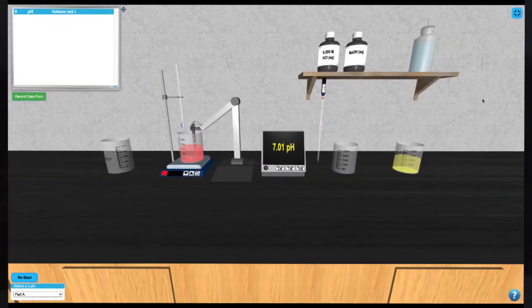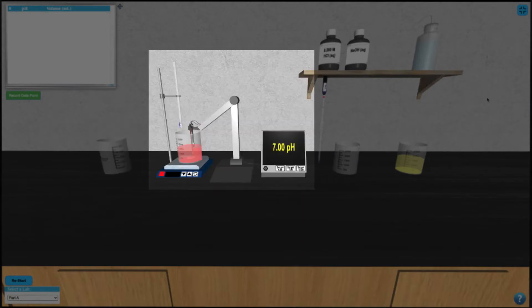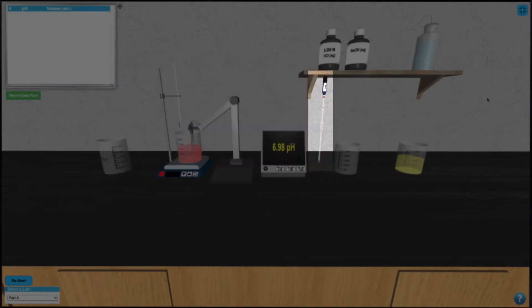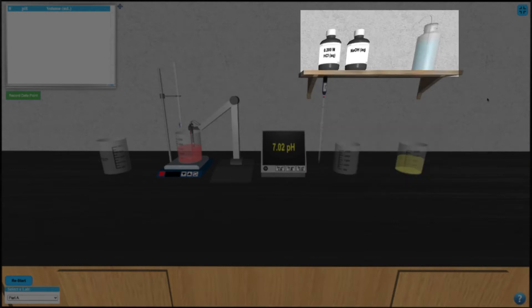In this simulation, we have a waste beaker, a burette with stir plate and pH meter, a pipette, sample beaker and calibration solution, and some samples to work with.